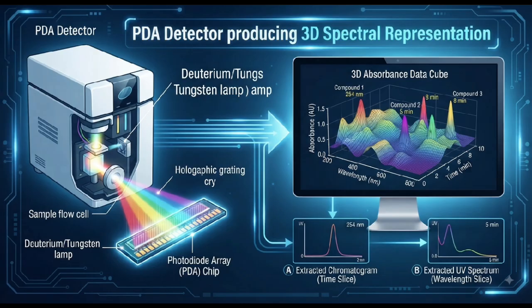PDA detector. In a PDA detector, we can obtain spectral information over a range of wavelengths. This makes wavelength accuracy especially important. A wavelength error can influence the measured absorbance and potentially affect quantitative results. Therefore, detector wavelength performance should be periodically verified using an appropriate reference.